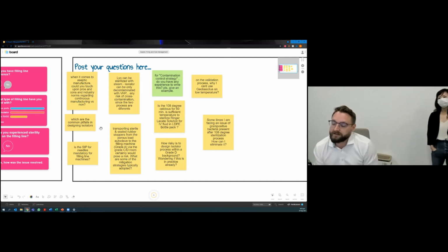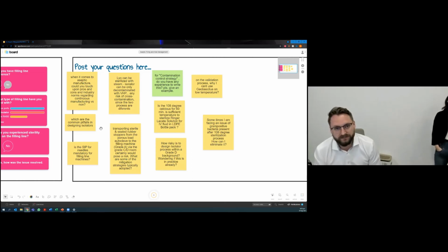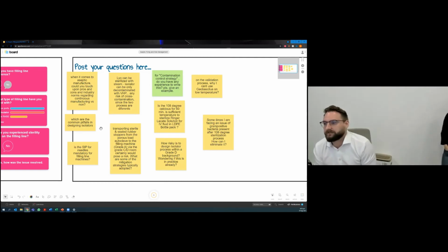I think they're sterilized separately, and then there's another sort of sterilization that happens as they're integrated into one another, something occurs there. To be honest, I don't really have a good answer on this one.